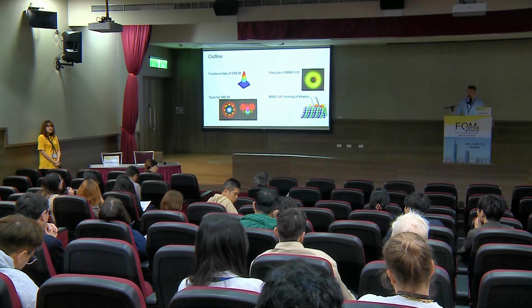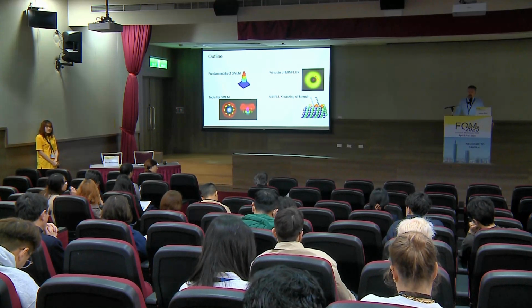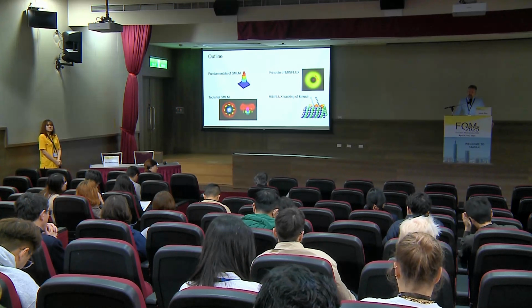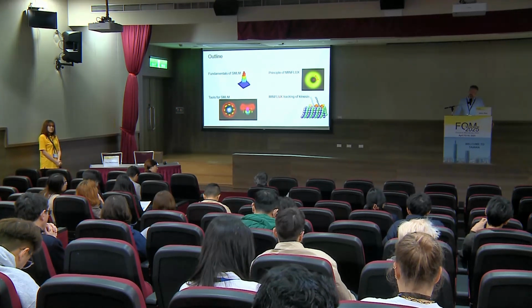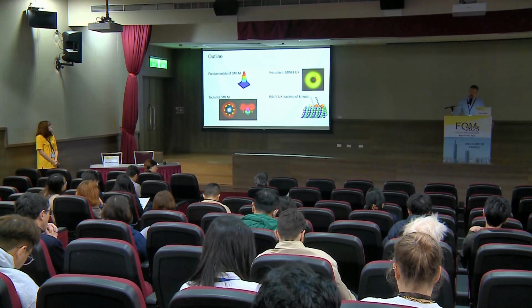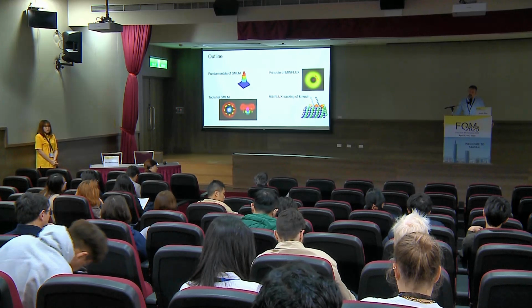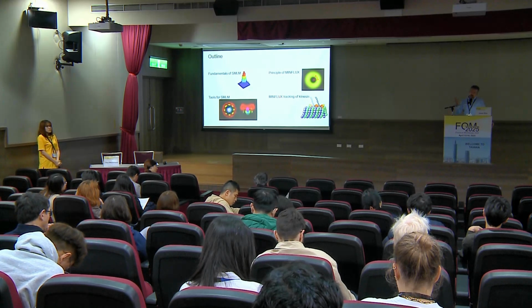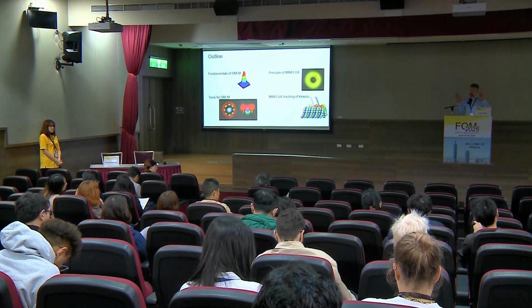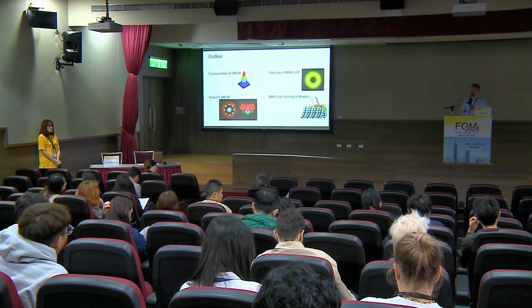Then there you have multiple channel detection, right? Then your registration error probably also will play a role here. It is, but we calibrate the transformation very precisely, either with beads, and of course there we can make an error, or with our IPSF, which learns the transformation during the optimization process. And since for biplane, but also for multicolor imaging, we really see the fluorophores on both channels, there is not really a problem with registration.